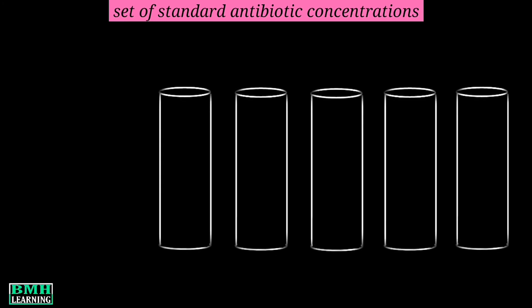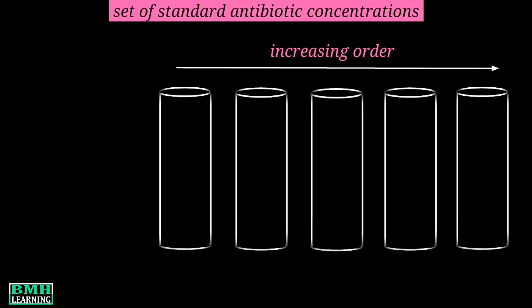Now, let's make the set of concentrations for standard antibiotic. We make five different concentrations which can be kept in increasing or decreasing order depending on your convenience. Suppose we are arranging the antibiotic dilutions in increasing order.